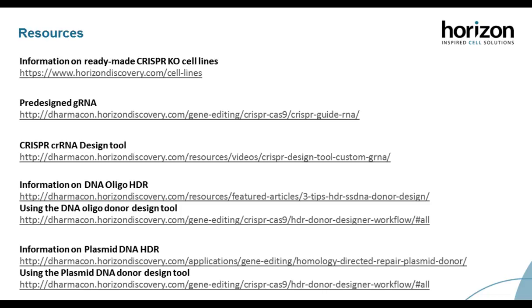Firstly, use the most up-to-date sgRNA design algorithms and select guides with low predicted off-target potential. This is what I was talking about in the session about considerations when designing your guide RNA. I really would recommend using guide RNA design algorithms that are constantly being updated and curated, and that would obviously be our design algorithm.